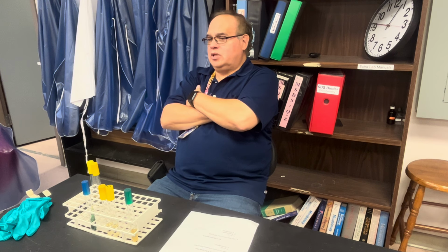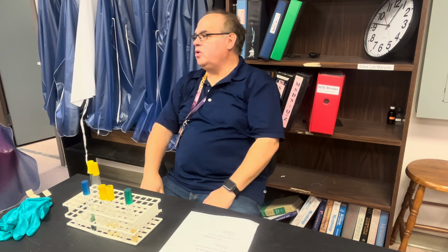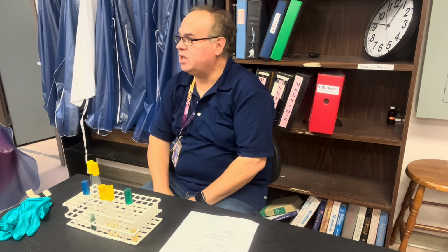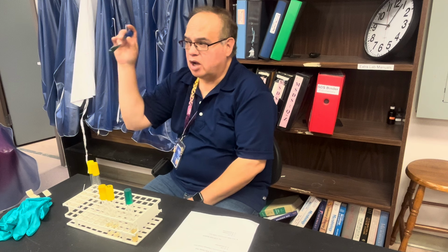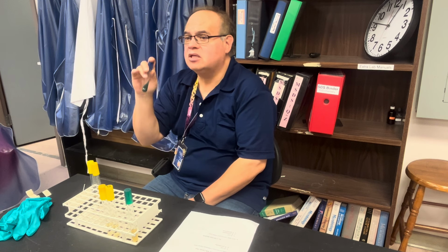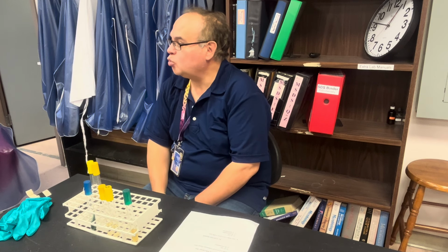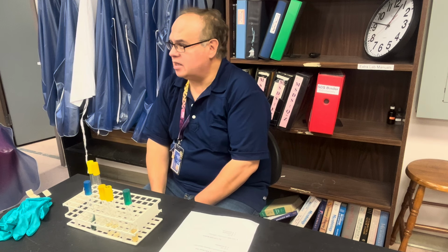When ammonia is released into the environment, does the pH go up or down? Up. Because ammonia is basic. It's going to cause the pH to go up. Therefore, a blue slant is an indication of a basic reaction, which is positive for your breakdown of citrate. Okay? All you're doing is inoculating. You're not adding any reagents today. Once you do that, you put them back on the red tray and then clean up, and you all can go home. We're done.